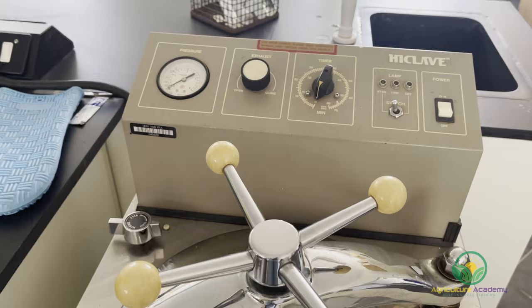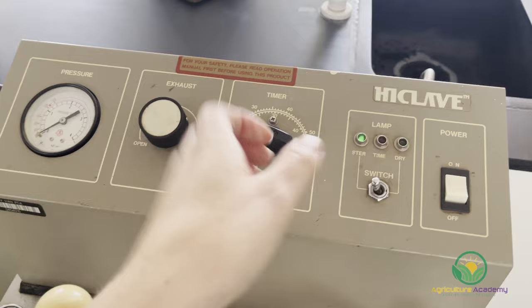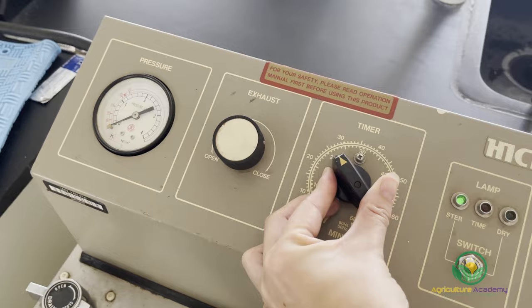We sterilized ours for 30 minutes at pressure. Once your medium is sterilized, leave it to cool and solidify. You can make up the media days, weeks, and even months in advance and keep it in the fridge for future use.